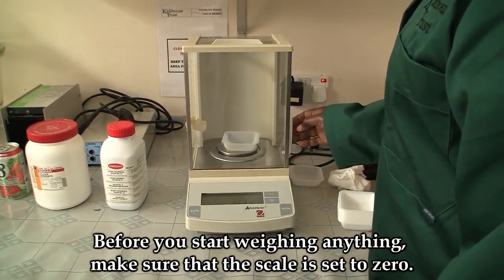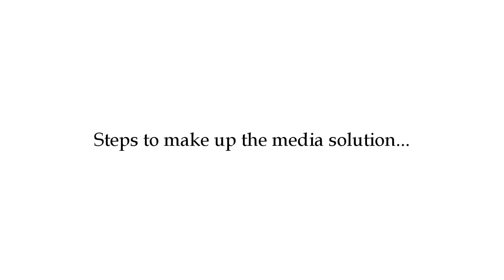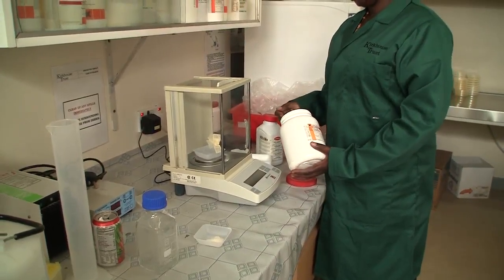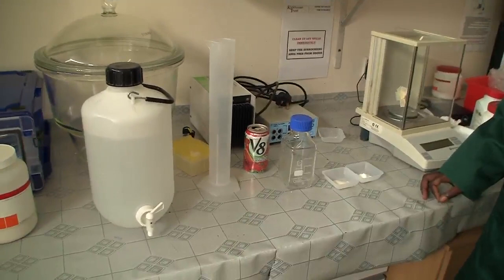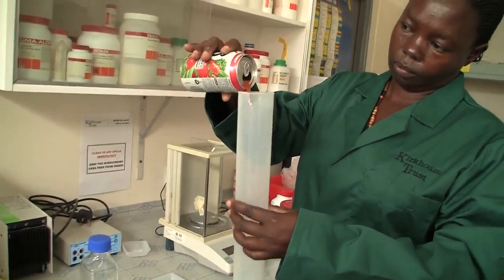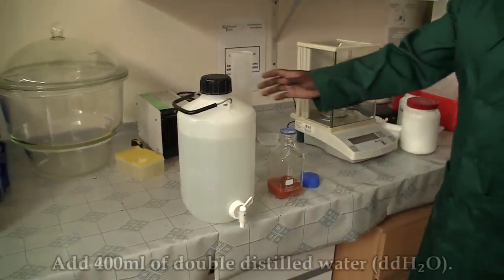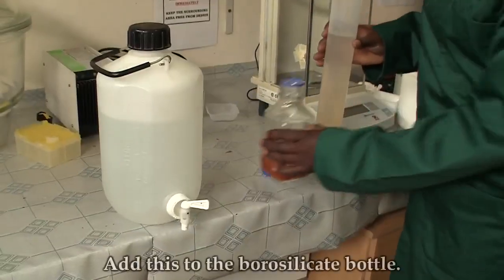Before you weigh, make sure the scale is at zero grams. Weigh 10 grams of Agar Technical and 1.5 grams of calcium carbonate. Measure 100 ml of V8 vegetable juice. Transfer all the ingredients into a borosilicate bottle, then measure 400 ml of distilled water and add it to the borosilicate bottle.